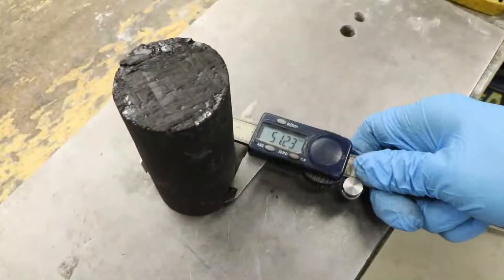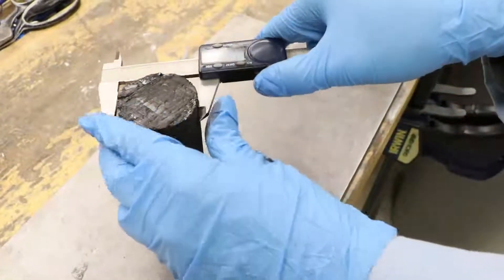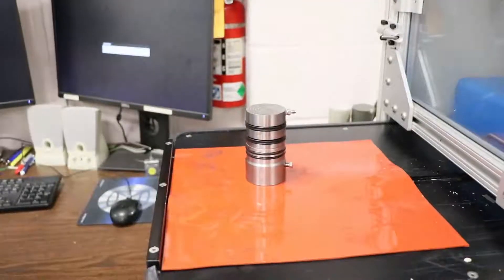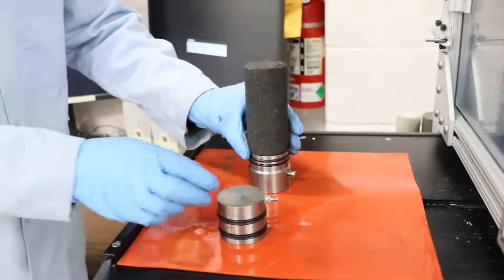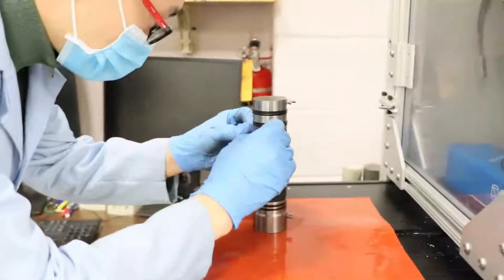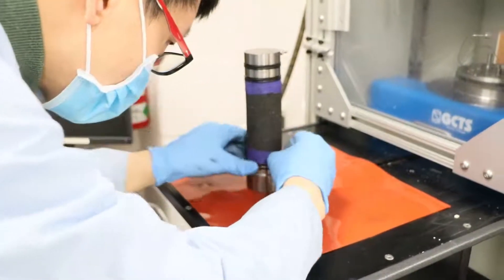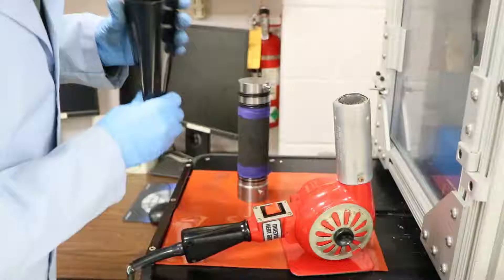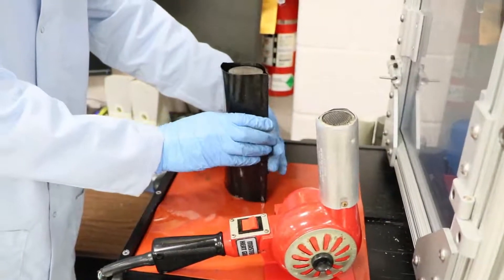We then measure the final dimensions of the dried sample. After this, we move to the sample installation. The cylinder core is sandwiched between top and bottom plates. We then make sure to use tape to stabilize the sample together. Then we cut the shrinkage tubing and put the sample into the heat shrink sleeve. We use the heat gun to allow the sleeve to properly shrink on the sample and cut off any excess pieces.